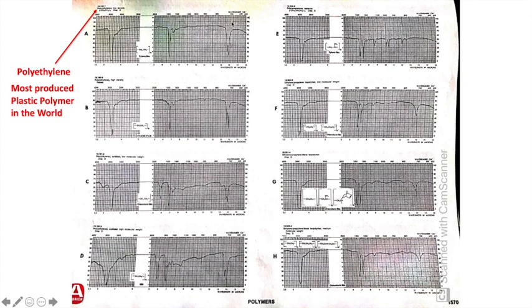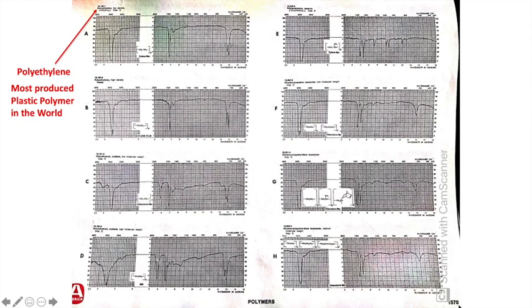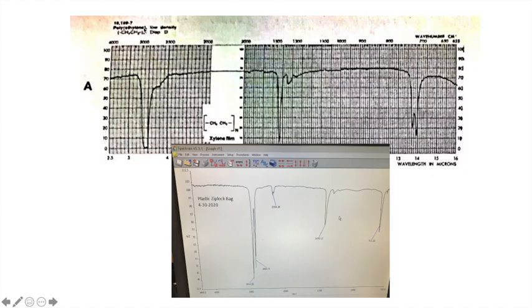What you're going to do is just visually look at these and see which ones look kind of like the polymer IR that we took. Here's another page. This is 1,570, 1,573, so I skipped some pages. So you can see there's a bunch of these polymers. Let's look at the polyethylene, that very first one, and compare it to ours. So this is the Ziploc bag.